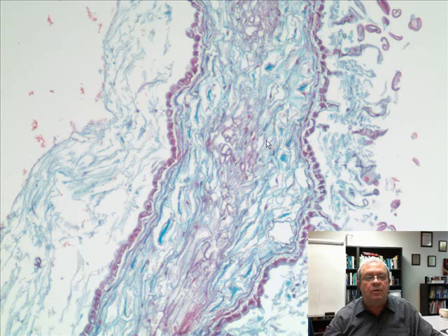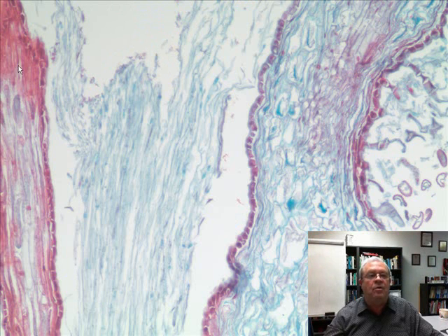And so here we have the outside of the stigma. It's hollow inside the stigma. And these are all pollen tubes heading on downward. And so we're starting to come back in, starting to narrow down as we approach the what part of the pistil or the carpel? The style. Yeah, let's go down a little farther. Oh, now we're narrowing down. Here's one. We've narrowed down. We're in the style now down here.